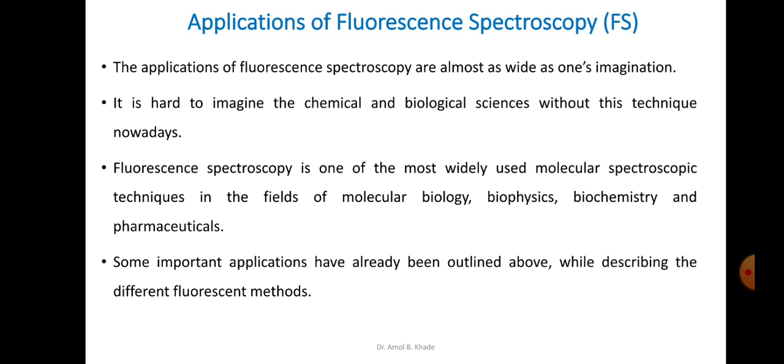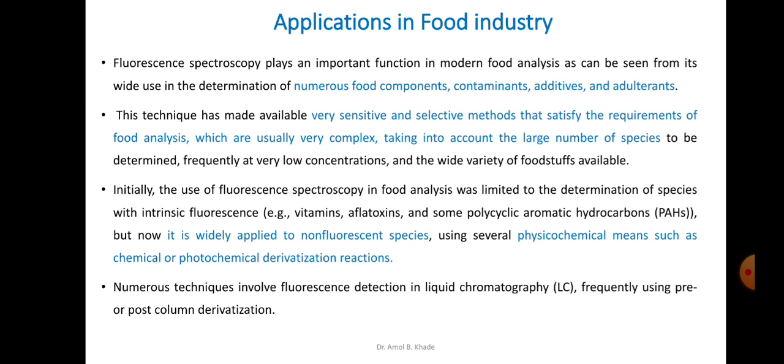So these are the fields where we can have wide varieties of applications of this spectroscopy, and the main reason behind using it is its selectivity and sensitivity. It is a very sensitive, very selective method, and because of that the method is very widely used. Some important applications we have already outlined in the previous discussion. We'll see one by one what the applications of this technique are. The first application of fluorescence spectroscopy is in the food industry.